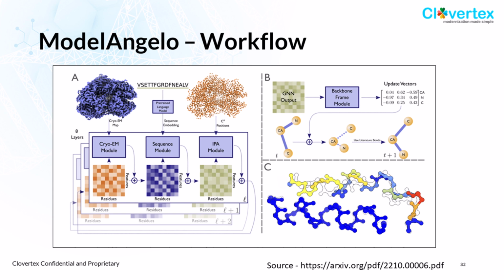I'll walk you through just one quick tool which is being developed by the Relion group called ModelAngelo for atomic modeling. They basically use the cryo-EM map, add the sequence encoding, and essentially they use a GNN to build the C-alpha atomic model.